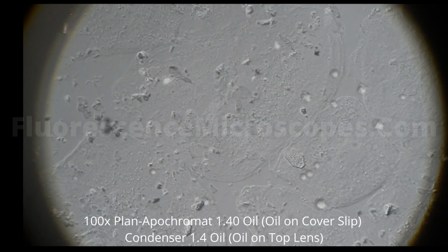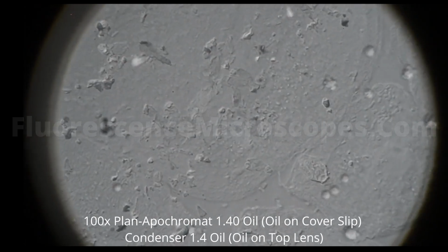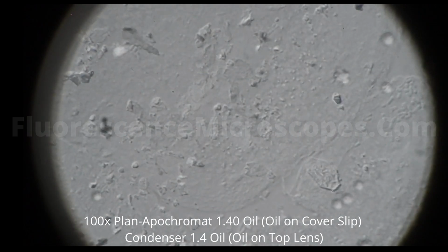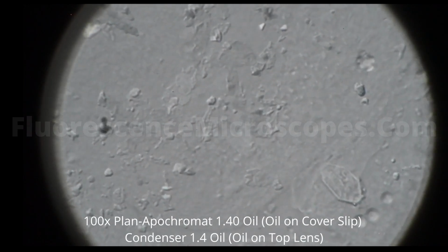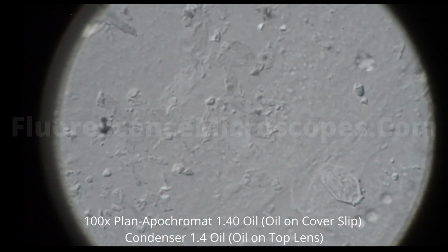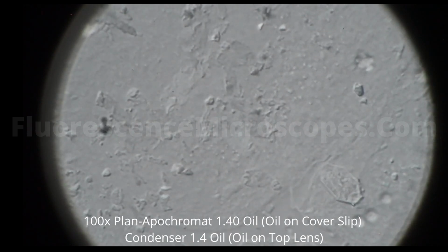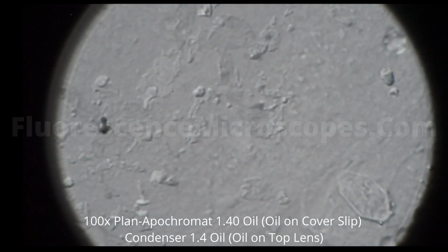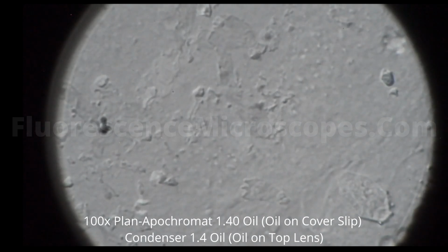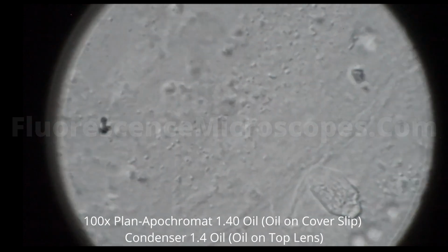So this is approximately 1000 power magnification. This is zoomed in 2x on the Optivar, so approximately 2000 power magnification. And 2.5x on the Optivar, so consider that to be 2500 power magnification.